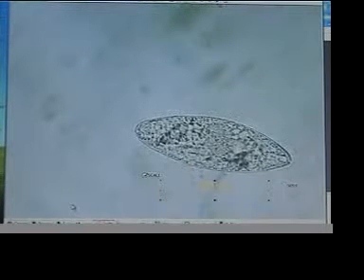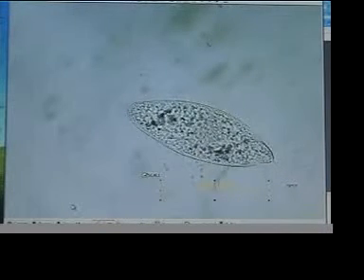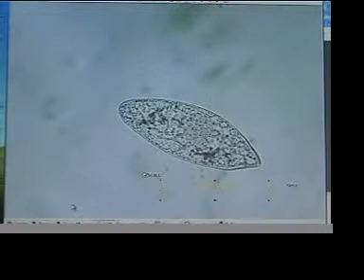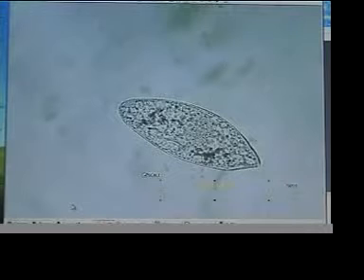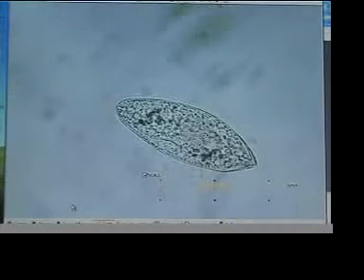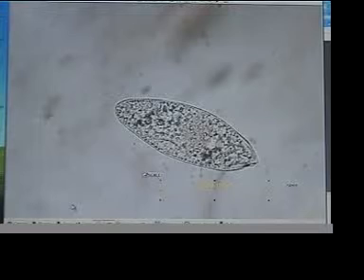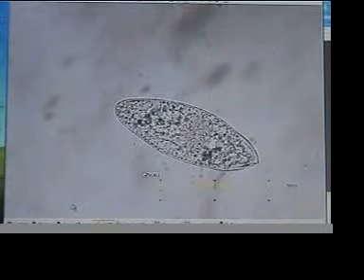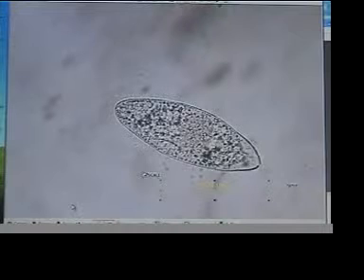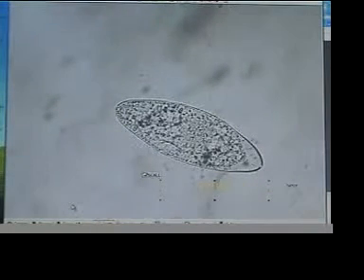Using a special microscope filter, known as the DIC filter, differential interference contrast filter, which is supposed to provide different angles of light, DIC, and how the light travels through the organism. Sometimes the DIC filter is good for catching certain details. You'll see the colors are subtly shifting. Sometimes the DIC brings out different aspects of the organism.